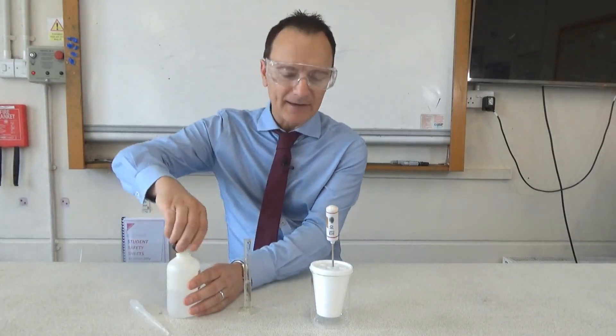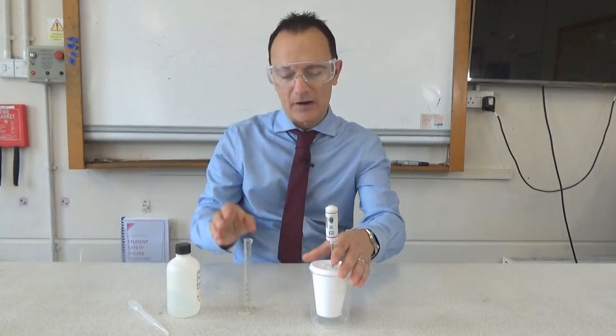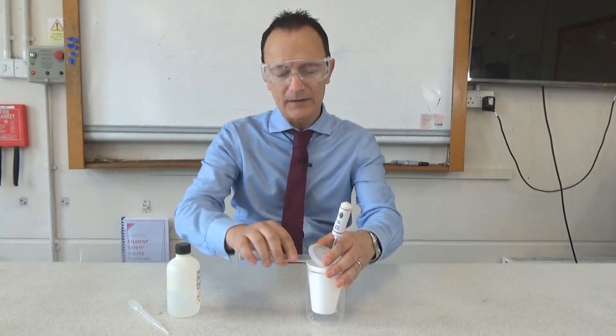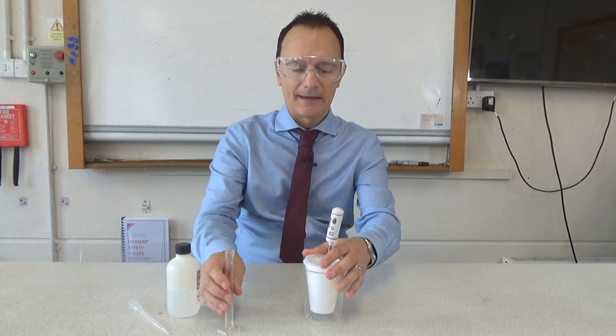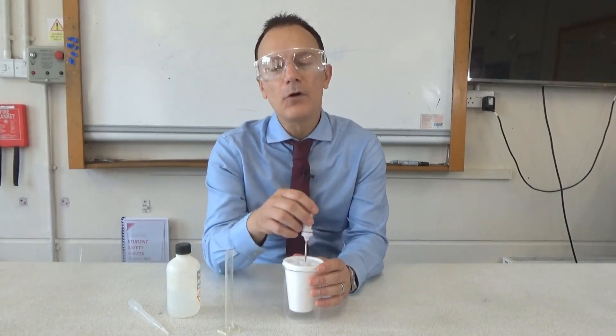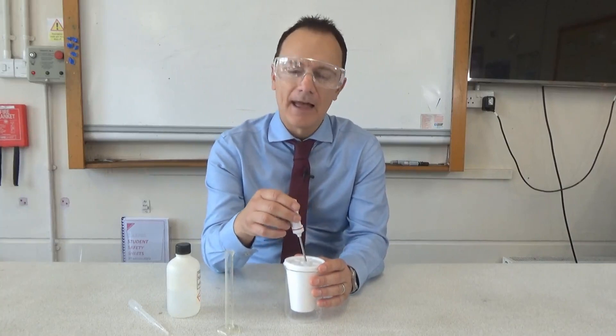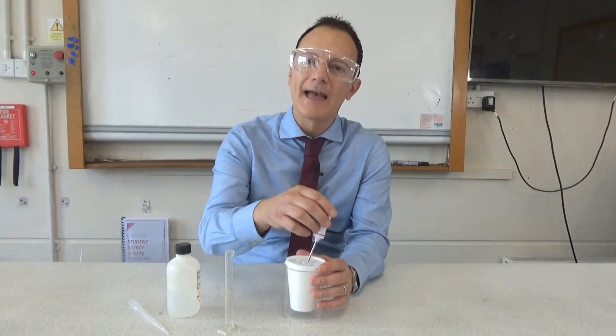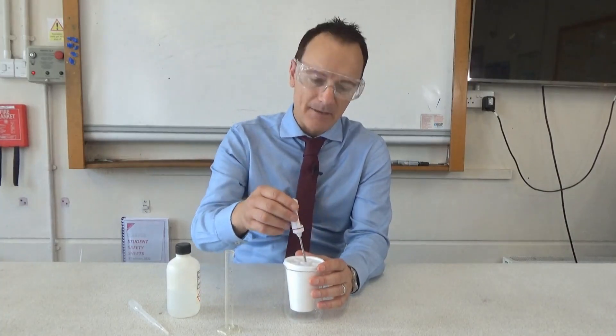Carefully take the lid off the polystyrene cup, add the sodium hydroxide to the acid, and give it a stir. Stirring is important because it ensures both chemicals react together fully and prevents hot and cold spots within the mixture, giving even heating throughout.